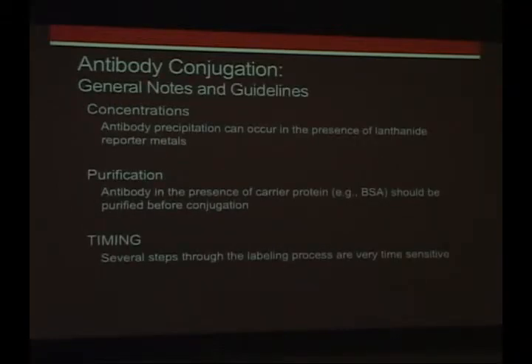So a couple notes and guidelines on the general protocol. First, the concentrations are fairly important, and sticking to the order of the protocol is important because high concentrations of lanthanide metals will precipitate proteins.